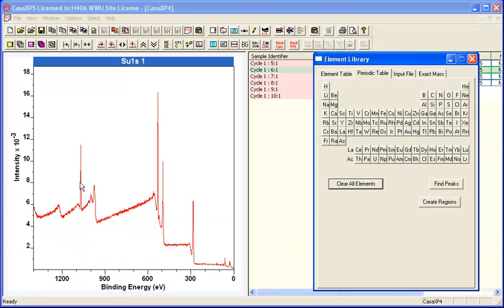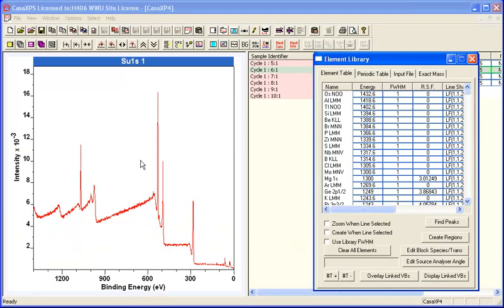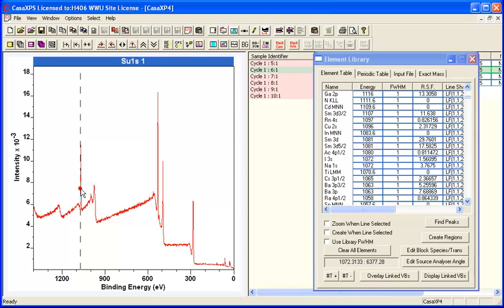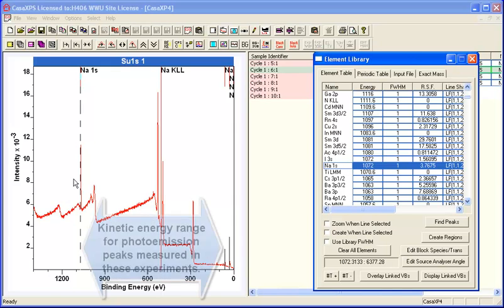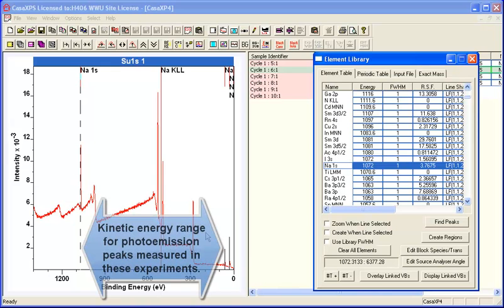For example, you might want to know what this peak here might be. If we click and look for a possible candidate, sodium 1S is very likely. You can see that it puts up markers showing various other sodium peaks, so we've got a pattern match for sodium.